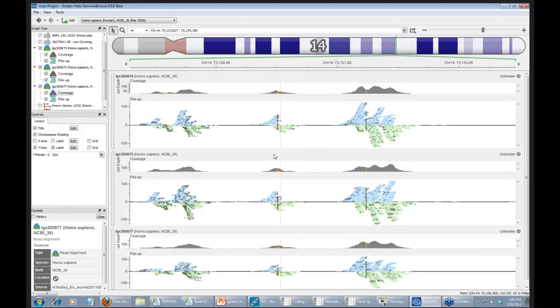Another question, the scripts that Ken used to collate spreadsheets and attach the quality information, we have a question if Ken created these or if Golden Helix did, and yeah, those are scripts that we created. So we wrote the code and shipped the file. Then Ken could access those features just by clicking the button or setting the drop down. So I'm just combing through these questions here.